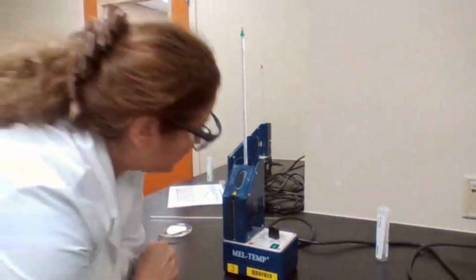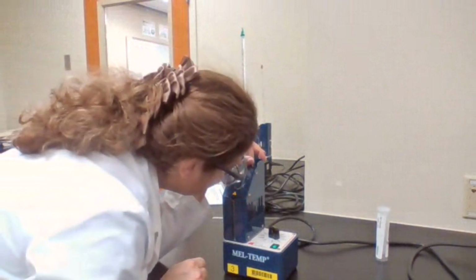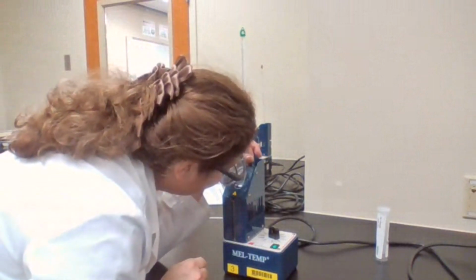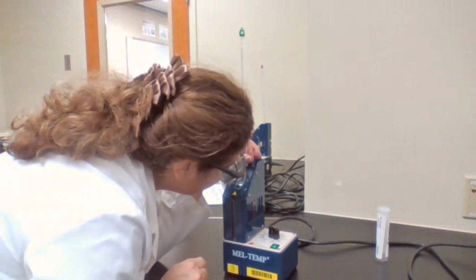I was trying to show you the time of the melting, so we could record the temperature based on your observation. But if it's blurry, then you have to just trust me. If it's hard to see, then I'm going to monitor and let you know as soon as it's melted.